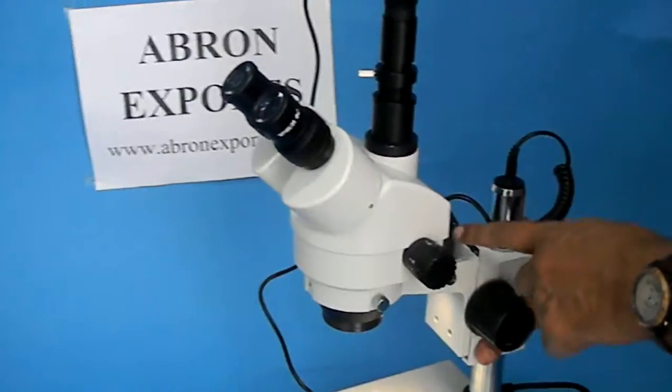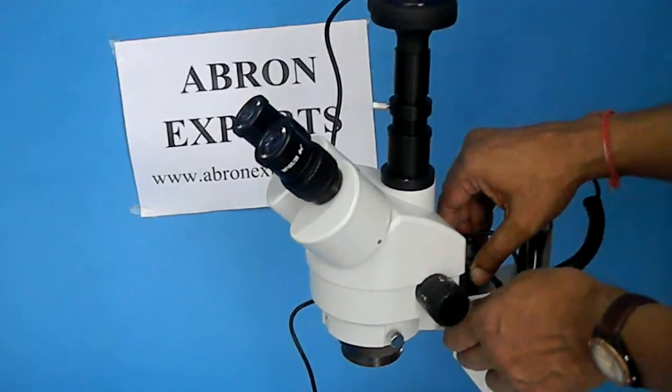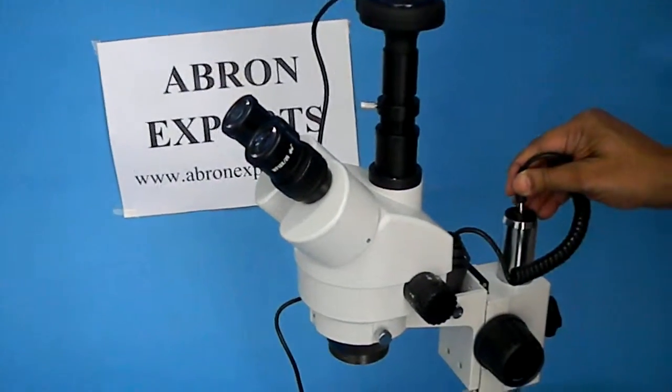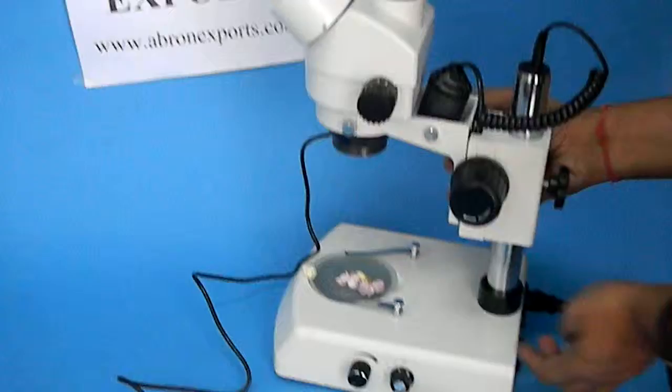This part is the lens, light, top light which you can adjust as per the angle. And this is for connecting to the wire on-off which is given on the back.